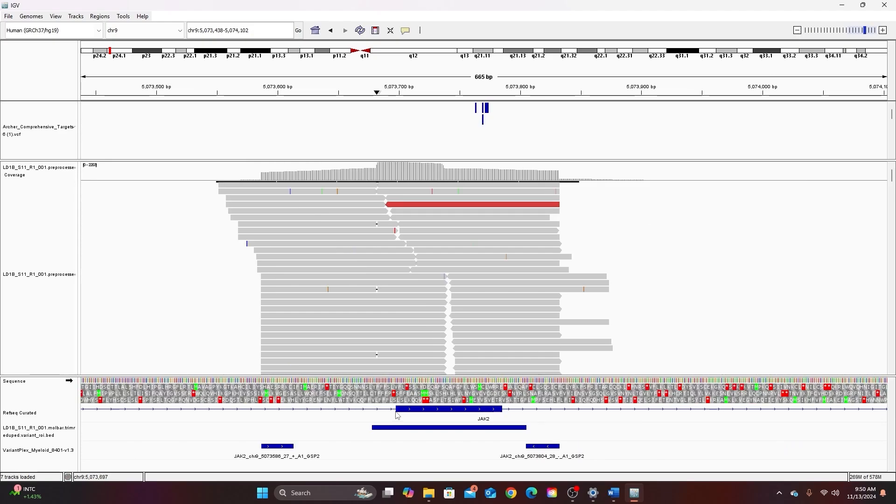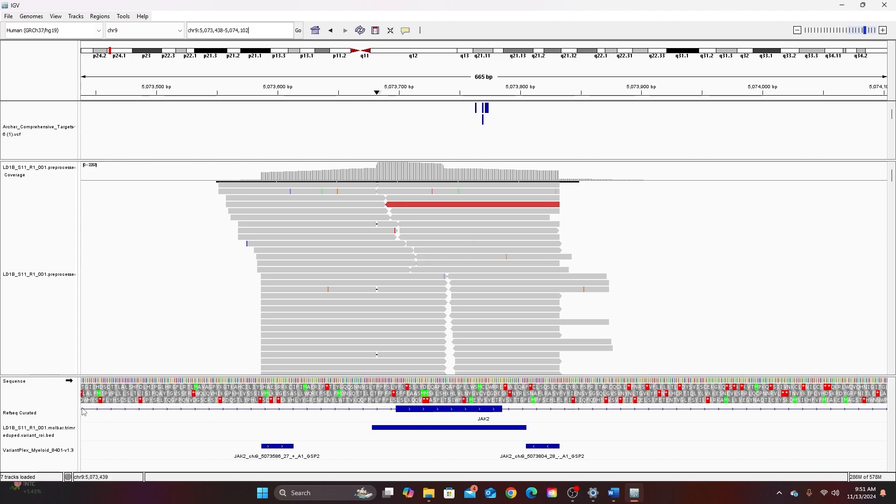So here it just shows the directionality of the strand. By default the forward or plus strand of each chromosome is displayed with the five prime end on the left and the three prime end on the right. The designation for forward or positive strand is not related to genes. It's just the strand whose five prime end is at the tip of the short arm of the chromosome.